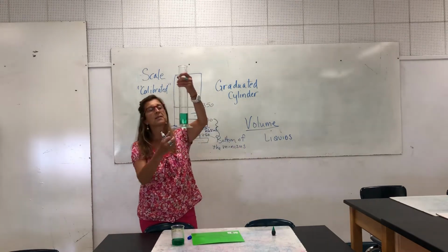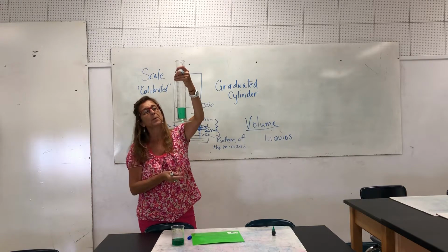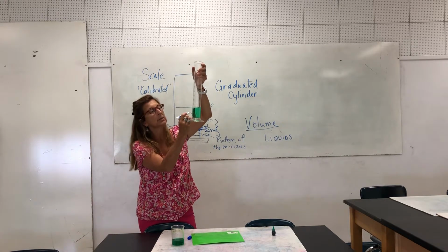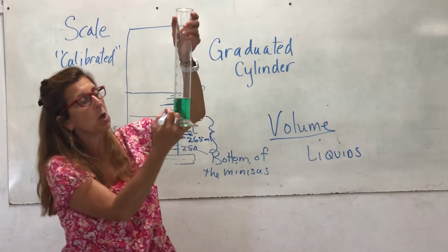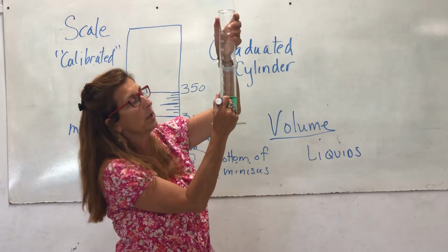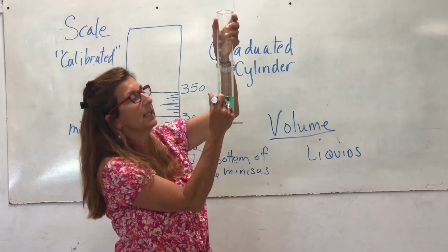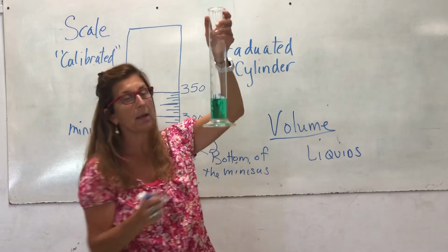So I don't know how well you can see this in the video, but I have a small meniscus in my fluid in here right now. And when I read this, I'm going to look from the bottom up to the smallest number. Okay, so cylinders count down and they also count up. So we're reading up from 50, we go to 75, we go to 100, and each of these is going to be worth 5, so it's 105, 110, and 115 milliliters would be the amount of liquid in this particular cylinder.